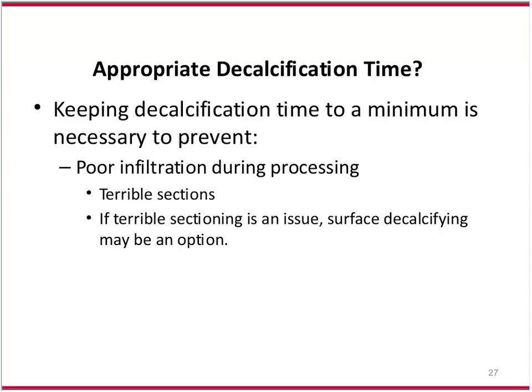We've actually had samples come to us where people have not decalcified them at all, and somehow it has come through the paperwork that, yes, we decalcified. So, okay, they're decalcified, we rinse out the samples, and we process them, and then when we go to cut them, oh, these samples haven't been decalcified at all.